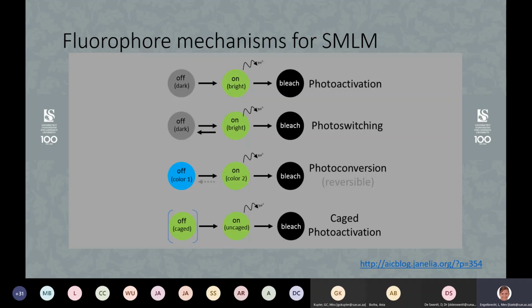You also get some types of fluorophores that can switch between a dark state and a light state. This would be useful when you do multicolor fluorescence, because when you image one color, that UV light is actually activating every color. It doesn't specifically activate only the red dyes or the green dye that you have. It will activate everything. But if you are able to switch everything that was activated by accident off again, and you reactivate, you can first go for one color and then go for another color in the next round. But eventually all of these would also bleach.